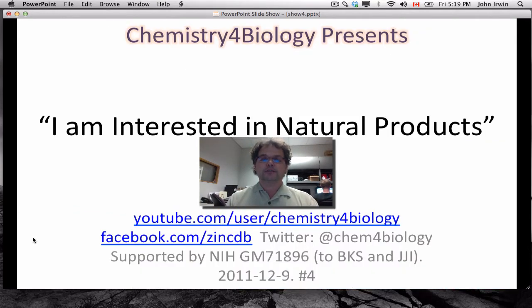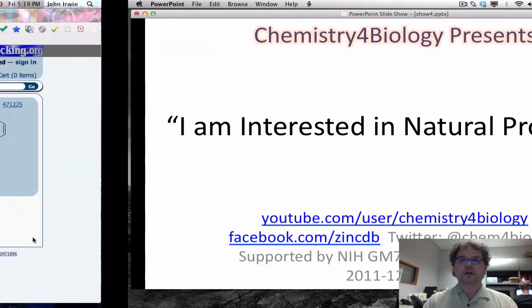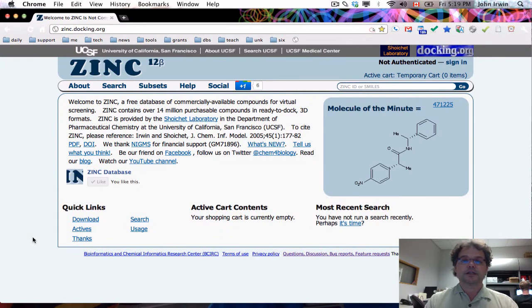Our topic today is about natural products. Natural products are very special molecules in the area of searching for new drugs. About 40% of drugs are natural products or derivatives of natural products. So there's a lot of interest naturally in looking at natural products. Let's get straight started. I'm going to show you how to use ZINC to work with natural products.